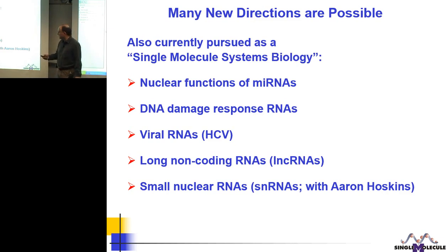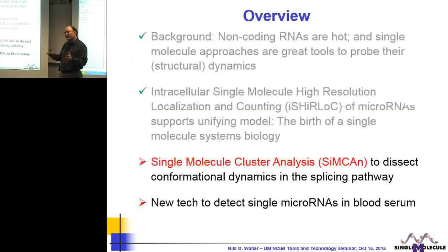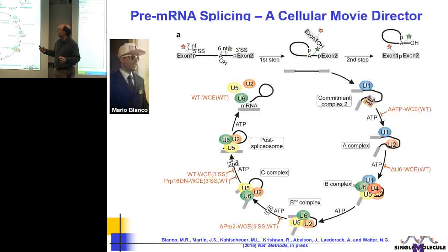We work with a collaborator in Madison on small nuclear RNAs. Okay, so a lot of different applications. And if I have a little bit of time, then I also wanted to talk a little bit about this cluster analysis that we do with single molecule FRET data to figure out splicing.